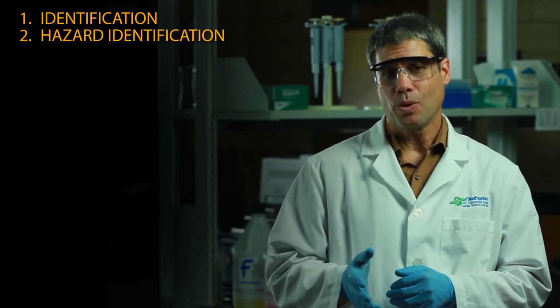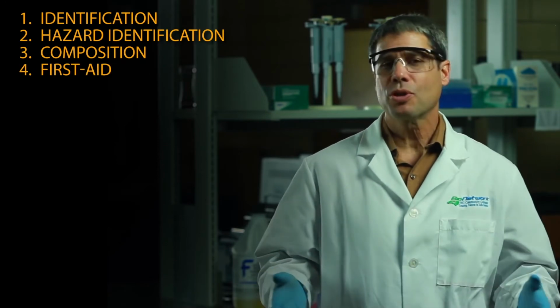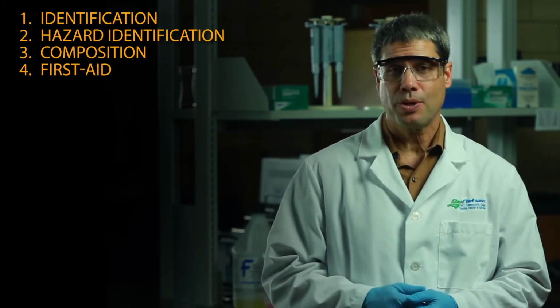Section 1, Identification. Here you'll find the chemical's name, description, and the manufacturer's contact information. Section 2, Hazard Identification. This section lists signal words, warnings, and safety symbols. Section 3, Composition, a list of ingredients. Section 4, First aid measures. What's the required treatment for a person who's been exposed?